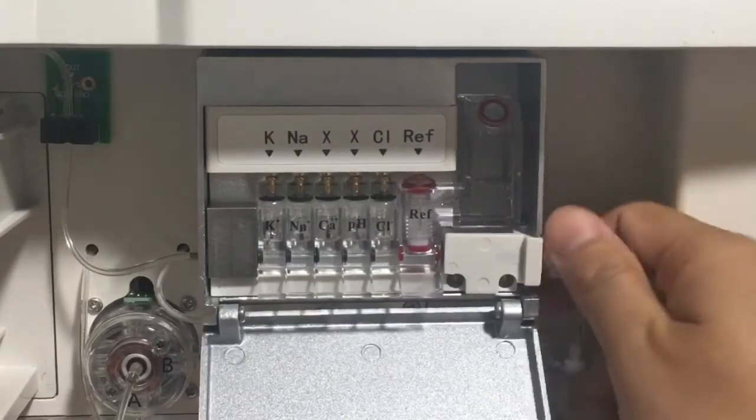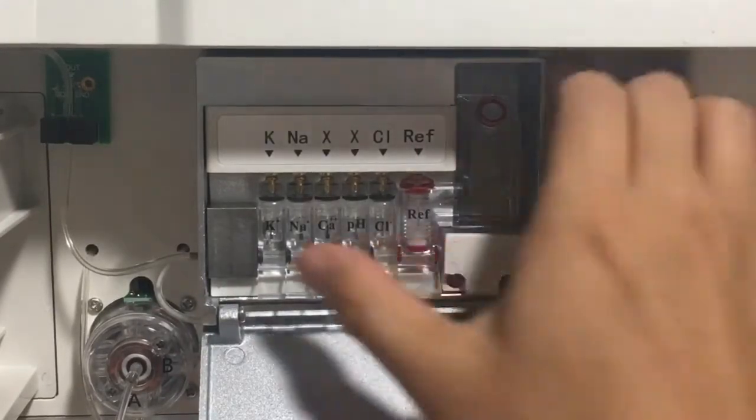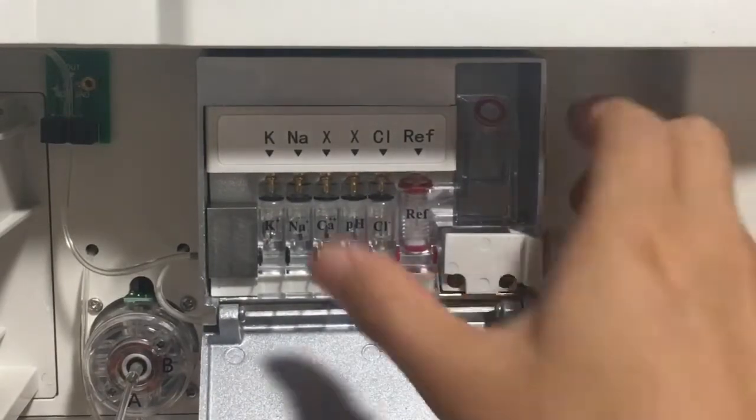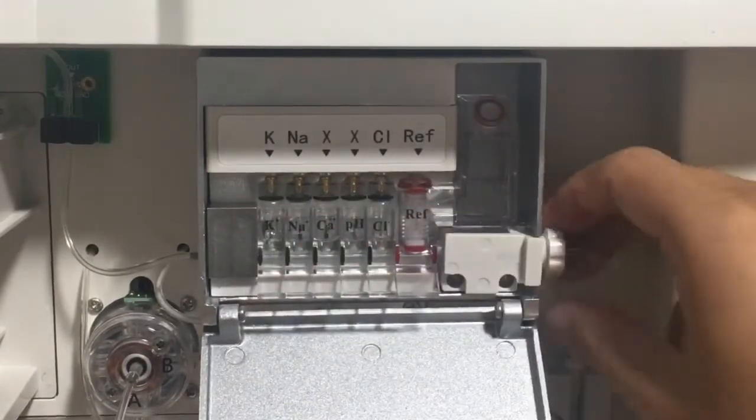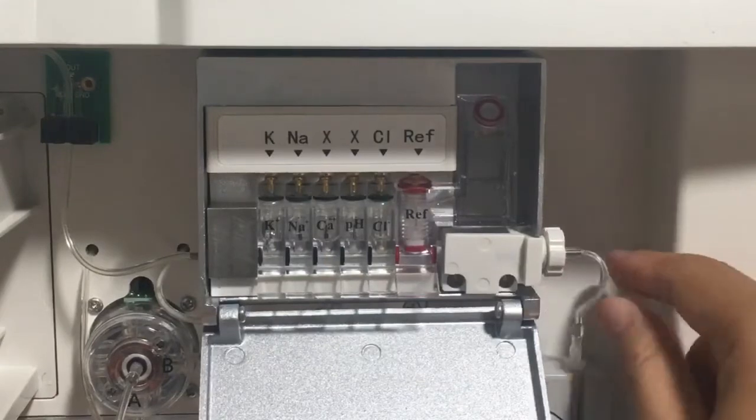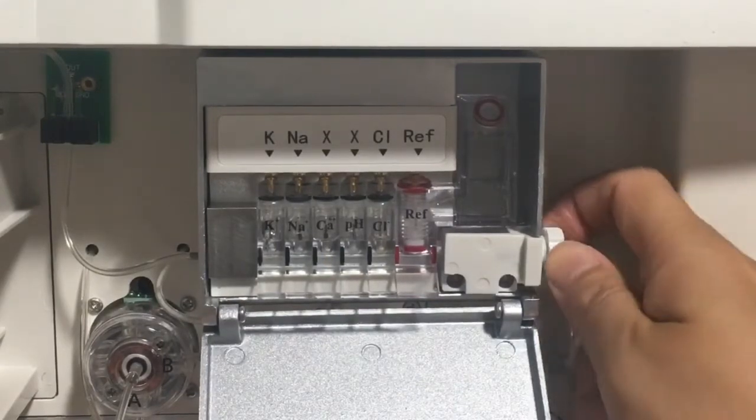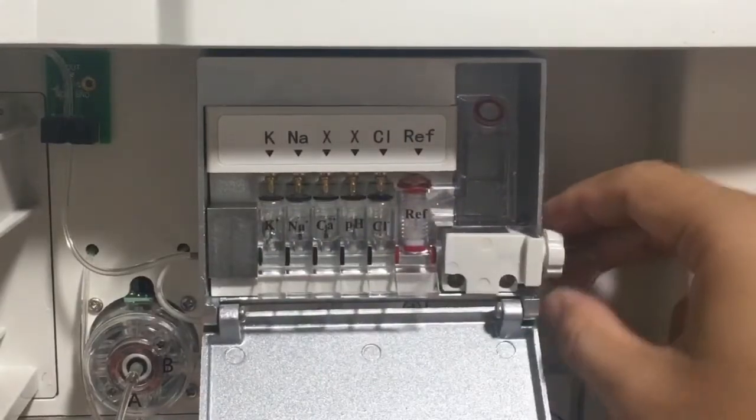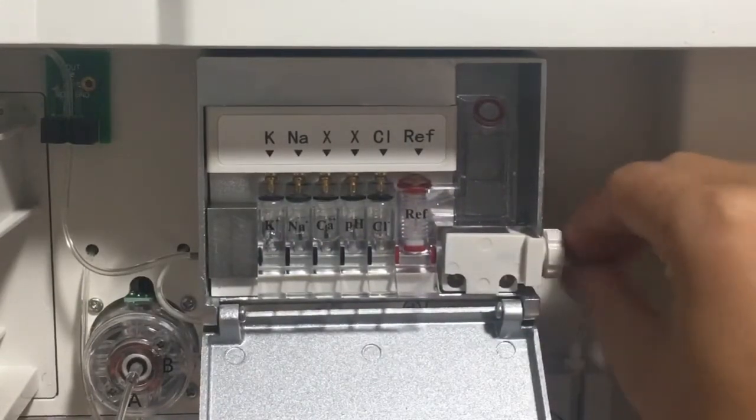And then tighten the knob. We use our finger to press the electrode to keep them in line. Also, we need to pay attention to the pipe here. Do not fold the pipe.